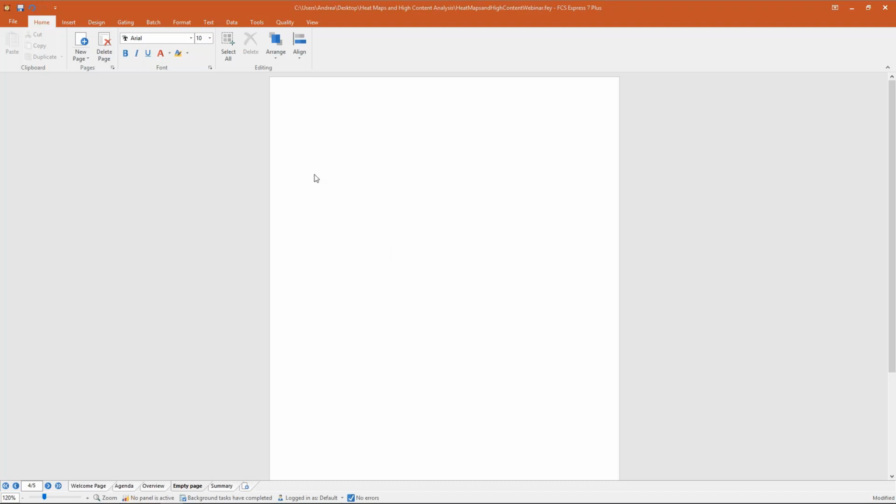I will go straight and open my first heat map plot. As I mentioned in the last page, we can deal with different file formats. So the first format that I want to open is a file that comes from BD Accuri. It's basically one single file containing all the data, and the extension for this file is C6.